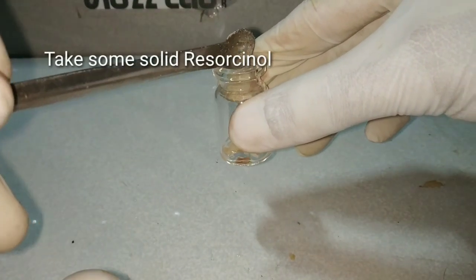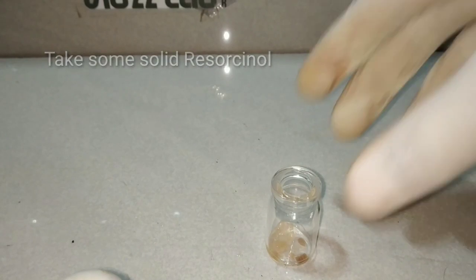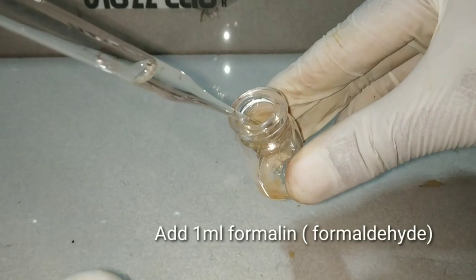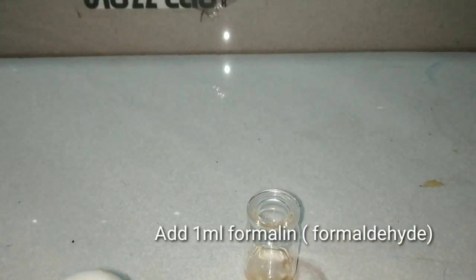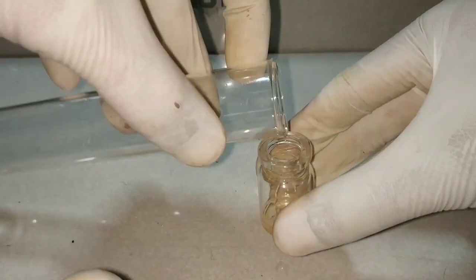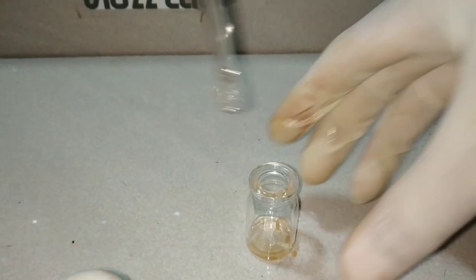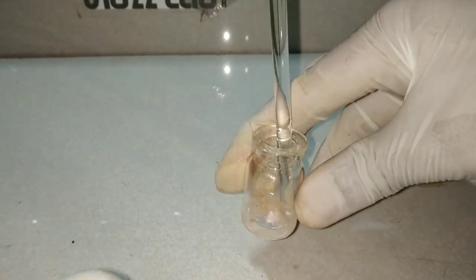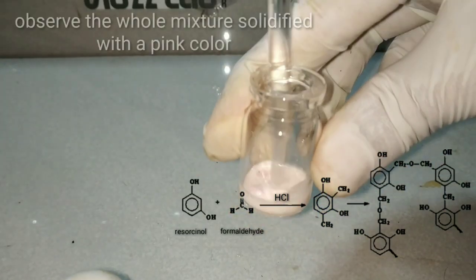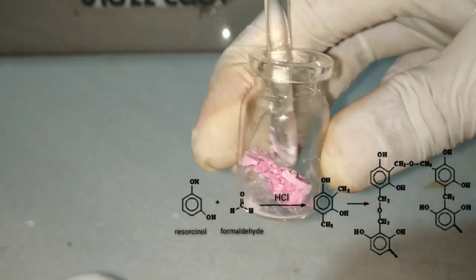This is an important polymerization reaction of formaldehyde with resorcinol. Here we have taken some resorcinol in a glassware and we are adding 1 ml of formalin, that is liquid formaldehyde. Now we will be adding a few drops of dilute hydrochloric acid. Now we will mix the contents well. You can see that immediately the solution solidifies and forms a purple colored polymer. This is the resorcinol formaldehyde resin.